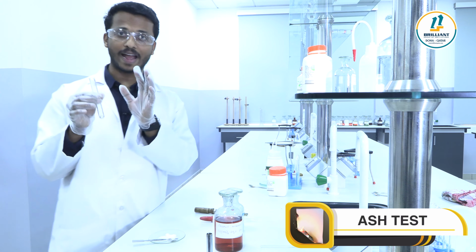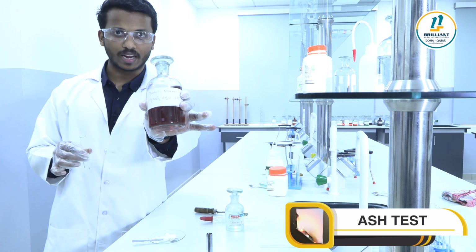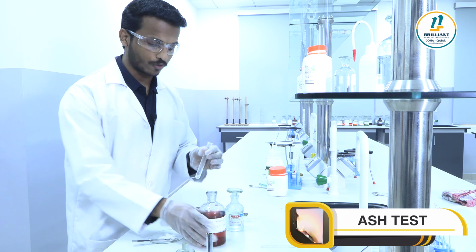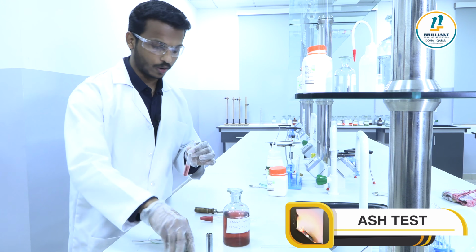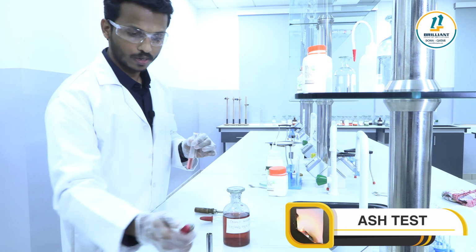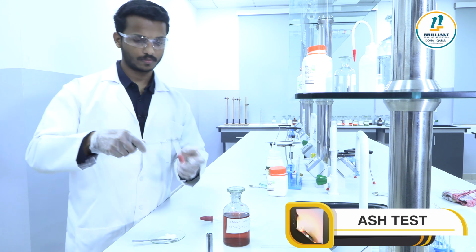So the main things in the ash test are concentrated nitric acid and cobalt nitrate. This is the cobalt nitrate solution. Let's add a few drops. Everything is added. Now we are going to heat this solution using a non-luminous flame.